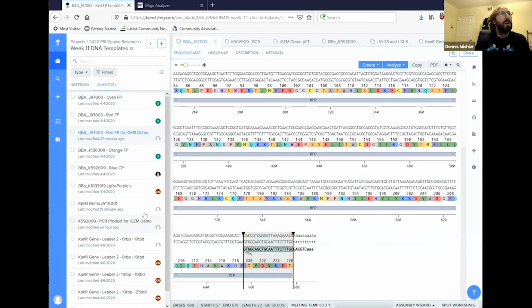If any one of you needs help to design such primers, which for example delete restriction sites, and you really want to do that, we can actually also help you in the office hours, specifically for your project, for your primers. Yeah, and that's great. There's one last question, then we're going to move on to the next thing.